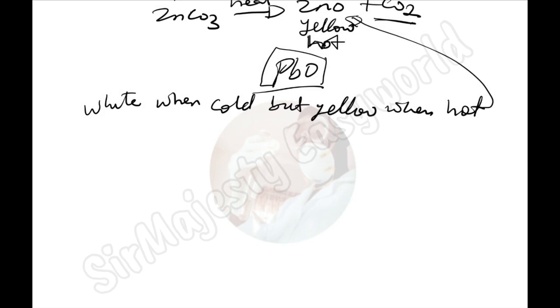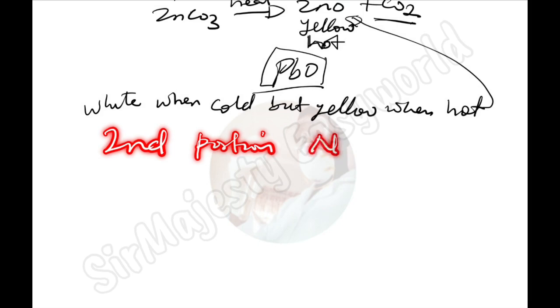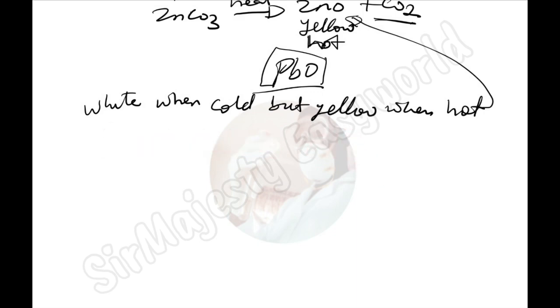Then to the second portion of the same filtrate, you will be required to do the same, but this time with aqueous ammonia. Your observation will still be the same as with sodium hydroxide, but your inference will not be the same. Observation here will still be a white gelatinous precipitate, which forms in drops and dissolves in excess aqueous ammonia. Inference will be zinc-2 ion confirmed. So let's go straight and make the table for the salt analysis from what I've been saying.